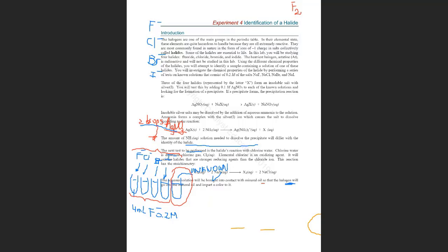But another thing that you are going to observe is how many drops of ammonia you need to add in order to dissolve the precipitate.